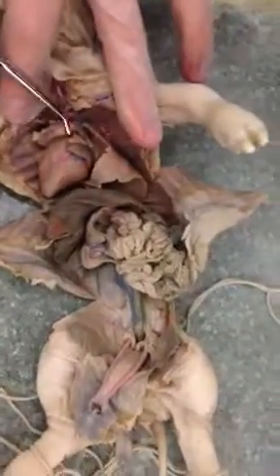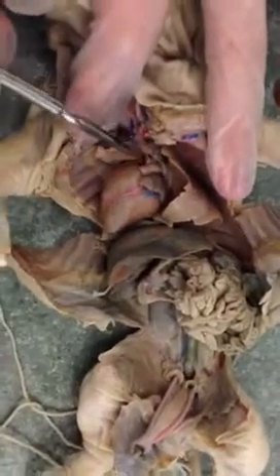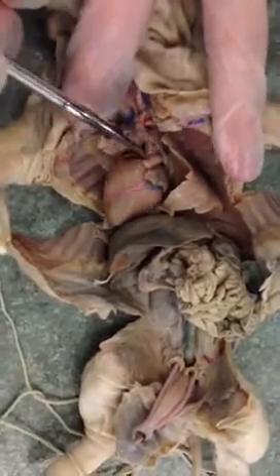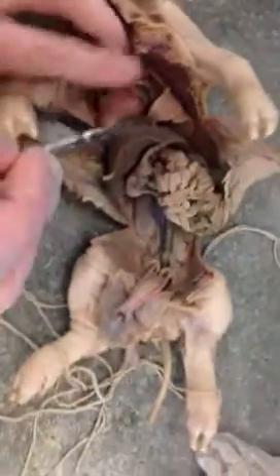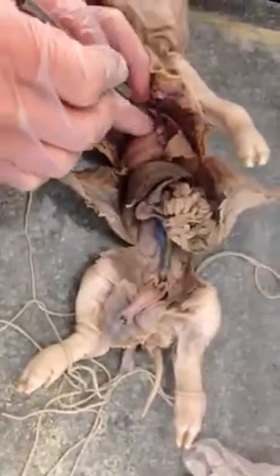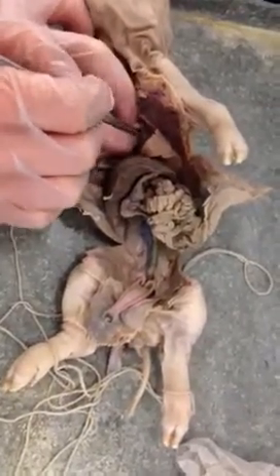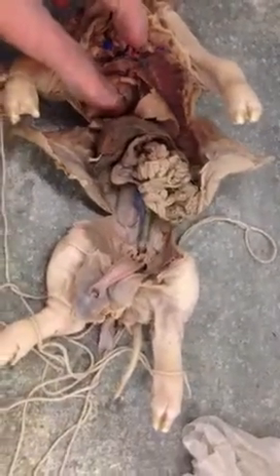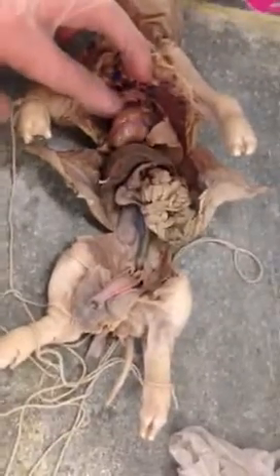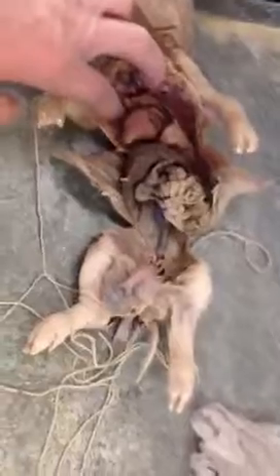And it's kind of hard to see, but the junction where the pulmonary trunk and the aortic arch meet is called the ductus arteriosus. Let me see. Yeah, it's kind of hard to see, but it's basically where they meet. And underneath that, you can see a pulmonary artery. So those are kind of hard to see. You have to dig deep, but just, yeah. Is there anything else? Nope. Yeah, that's it.